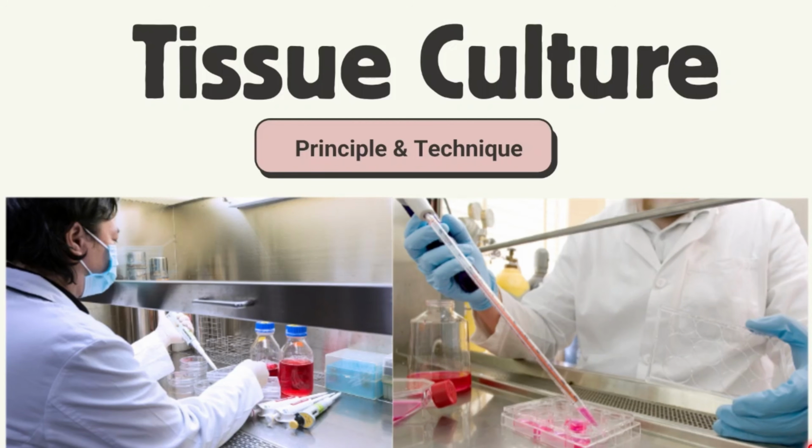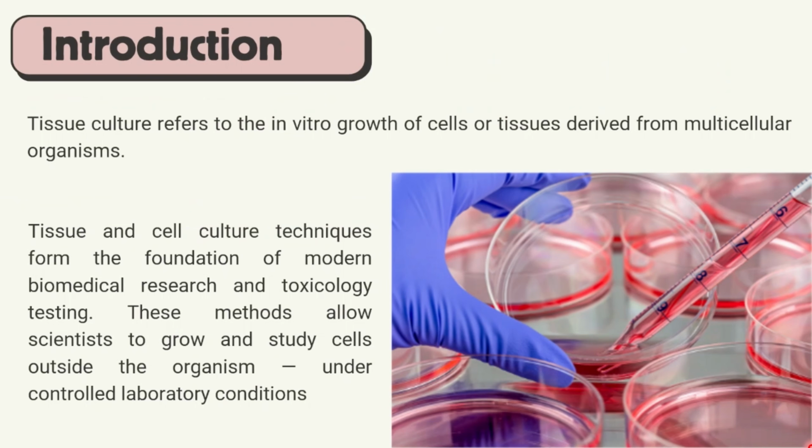Today we are going to be talking about tissue culture, sometimes called cell culture. Now, tissue culture refers to the in vitro growth of cells or tissues derived from multicellular organisms. And this is the foundation of biomedical research and toxicology testing because these methods allow scientists to grow and study cells outside the organism under controlled laboratory conditions. So you find that a lot of toxicologists use this technique to study the effects of toxins on cells before proceeding to in vivo studies.